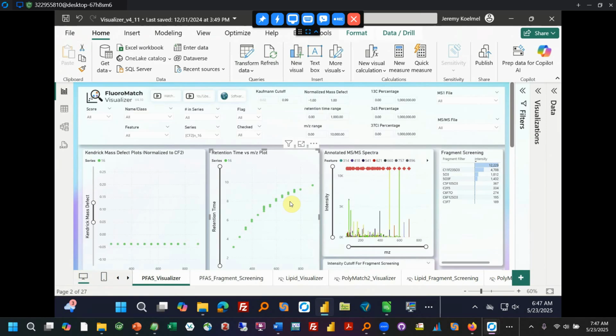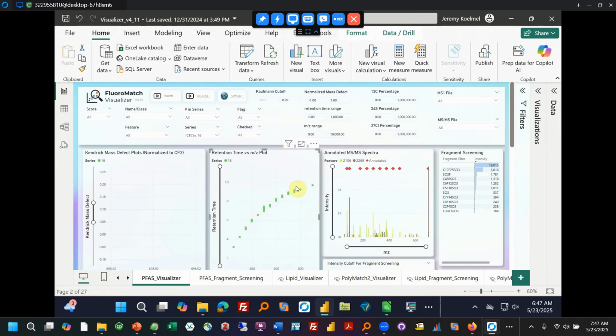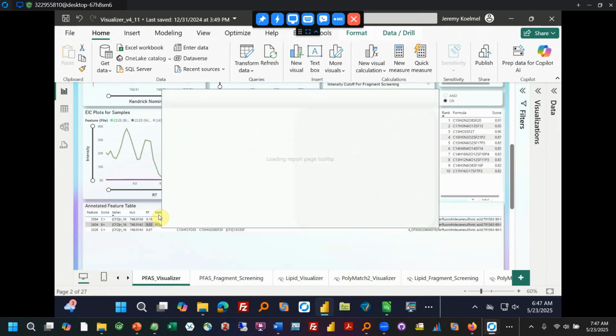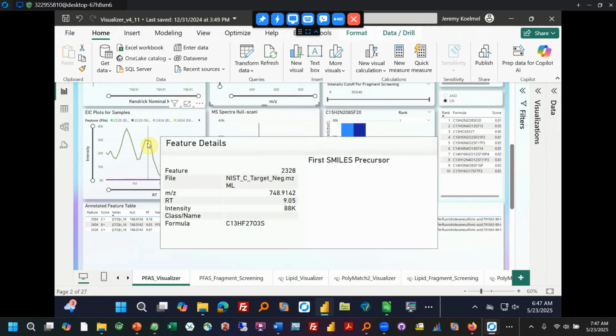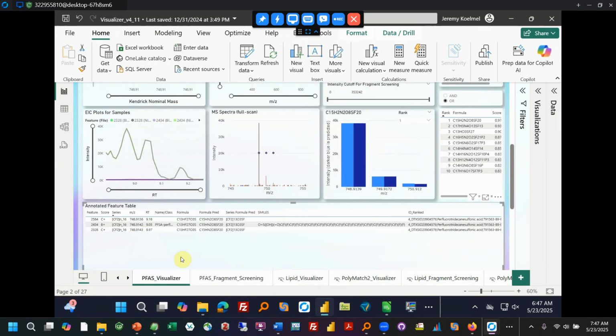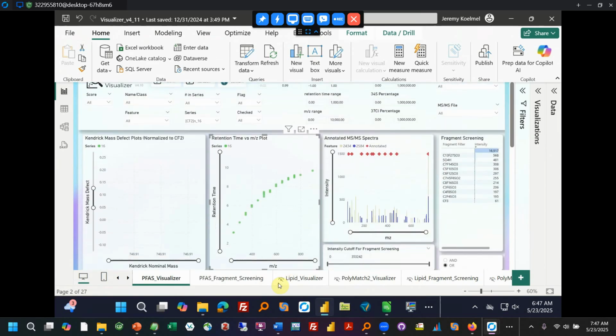So again, I'm just clicking through and making sure that at least those isomers are correct. There may be more isomers as we've been seeing, but I just want to make sure that the ones that it is identifying that we may do statistics for, etc., are correct. So 9.18 would be this one, 9.05 would be this one, and 8.97 would be this one. So again, could be all correct isomers. So I'm going to be happy with the rest of them.